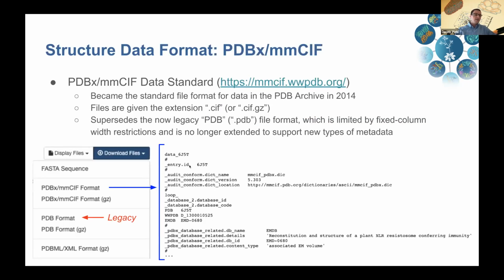So when downloading structured data, it's important to be mindful in selecting what data format to use. Of particular note, it's important for us to emphasize that the current standard file format for data in the PDB archive is PDBx/mmCIF, which is data with the extension .cif or .cif.gz. And this is the official format, and users should use this. And if they're not using this already, begin to migrate to using this.